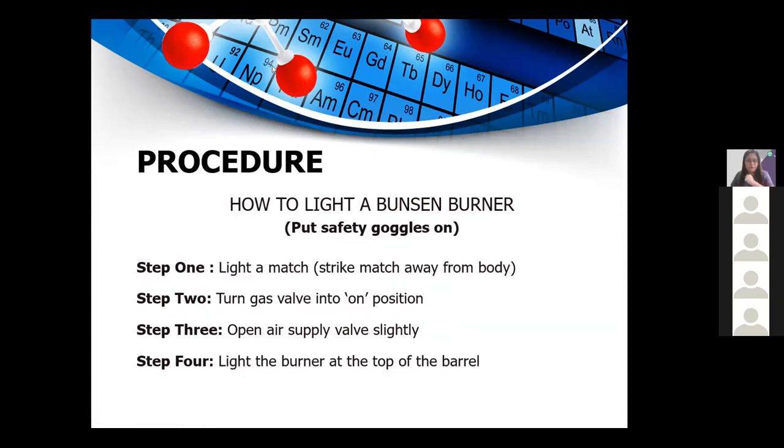To properly demonstrate the setting up, lighting, and turning off of a Bunsen burner, I will show you a video first.